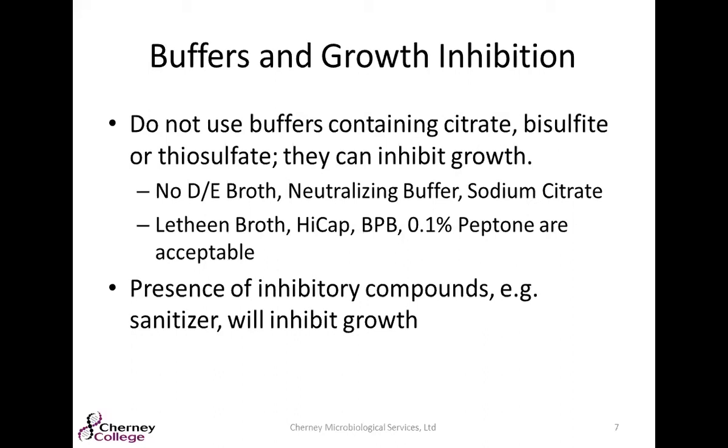Acceptable ones would be Letheen broth, HiCap broth, BPB diluent, and a 0.1% peptone all work well with the 3M Petrifilm. You'll also want to keep in mind that the presence of inhibitory compounds like sanitizer are definitely going to affect your growth recovery on 3M Petrifilm.